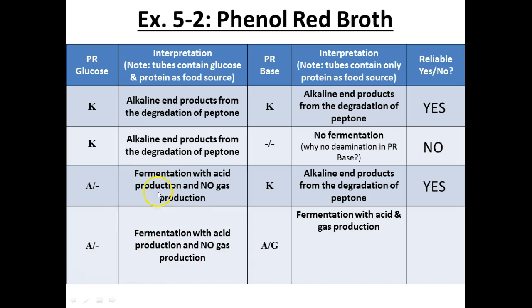Ate the sugar, right? Acid, no gas. Somehow in a protein tube, it's yellow with a gas bubble. Is that possible? No. Right? So this would not be a reliable result. Reliable to determine if phenol red is present? No, phenol red is a pH indicator, right?